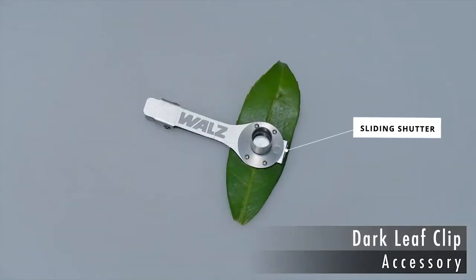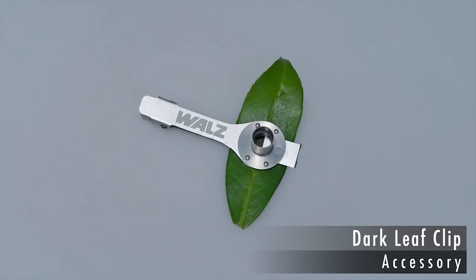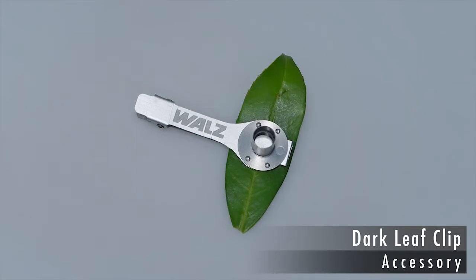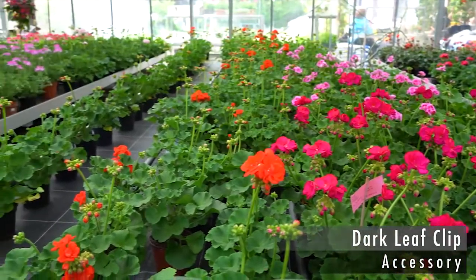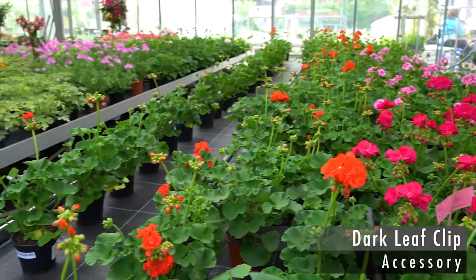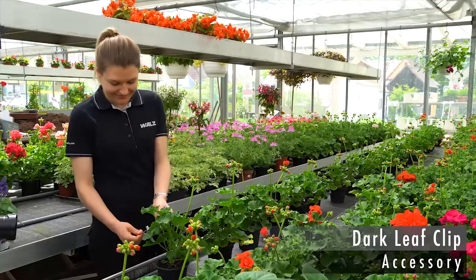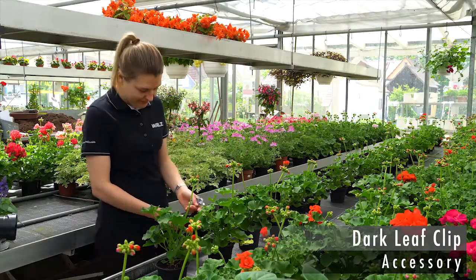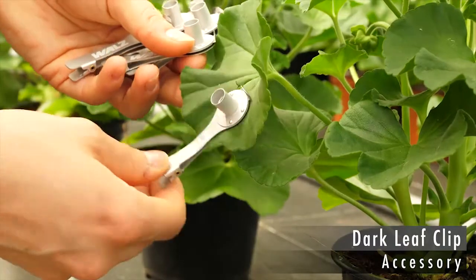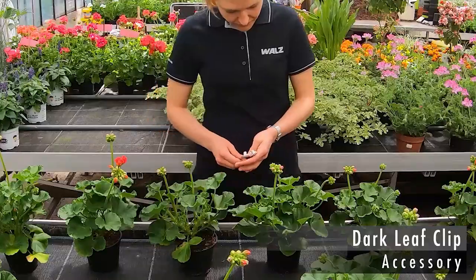With the shutter closed, the fiber optics is inserted into the cylindrical sleeve of the clip. The shutter is then opened in order to measure the FV/FM value. A good example of the use of the clip is from a study investigating the effect of soil composition on FV/FM in ornamental plants. To prepare the measurements, Sabrina positions one dark leaf clip on each plant, greatly increasing sample throughput.